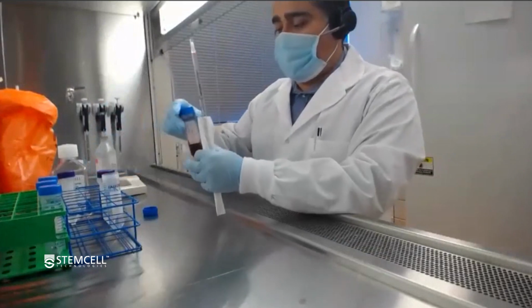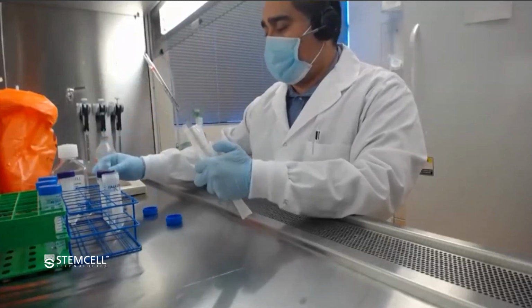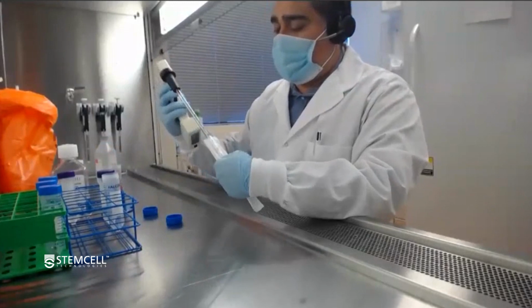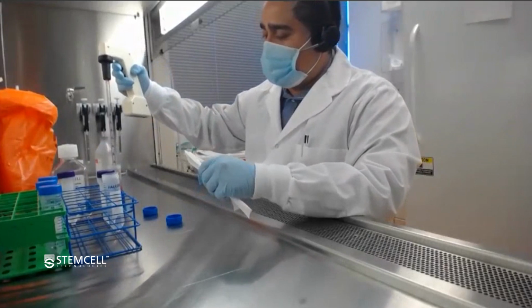So in this case, we're going to be using 5 milliliters of whole blood. If you were using less than 5 milliliters, we do have a SepMate 15 that can accommodate smaller volumes. And this SepMate 50 tube can accommodate start volumes of whole blood from 5 to 17 mils.